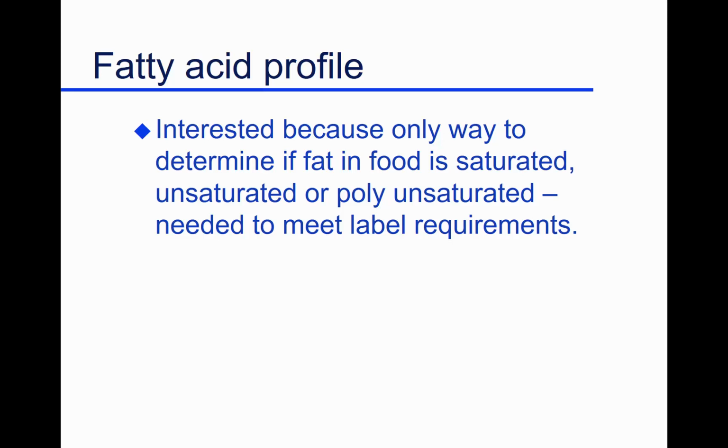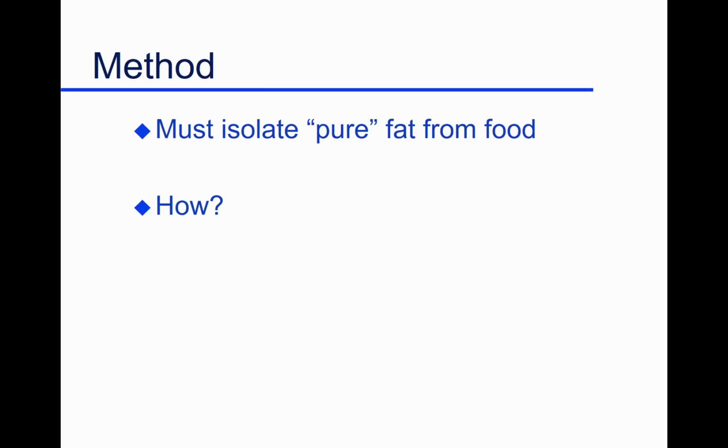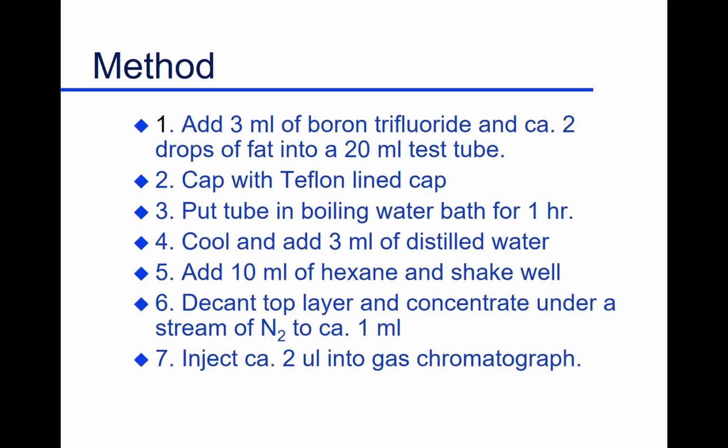Fatty acid profile, that again, many of you have done. You must isolate a pure fat from a food. You might do that by a Soxhlet. It's fairly common. You're doing proximate analysis. You're going to be doing a fat extraction. Good, you have fat. You got pure fat for further analysis. And what you did, I believe you followed the same procedure.